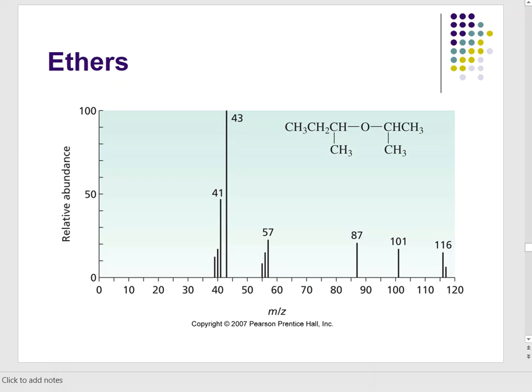So we just determined where the 101 could come from. This was due to our homolytic cleavage. It happened 3 ways out of the 4 options that we basically gave. So 101 would be fairly high, right? The other option that we did with homolytic was 87. So we saw where that 87 can come from.